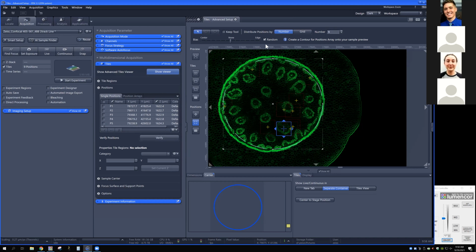And it randomly assigned positions all the way through this. Okay, not the best job of distribution, but here we are. Can you re-randomize? You would have to redraw. Actually, yeah, unfortunately. So I can delete this again, but that being said, yeah, I think you'd have to redraw.